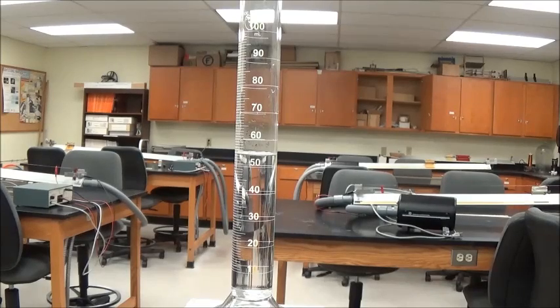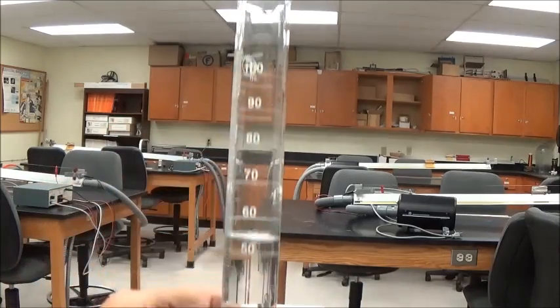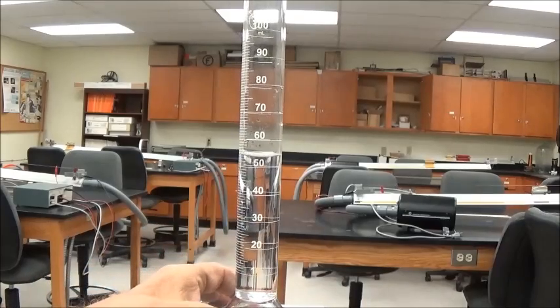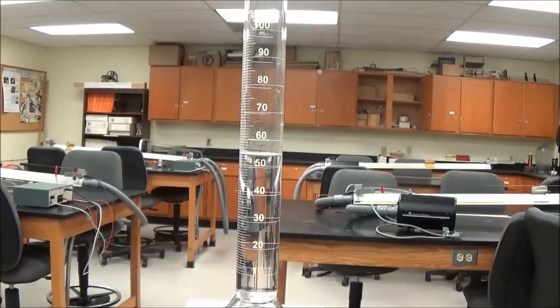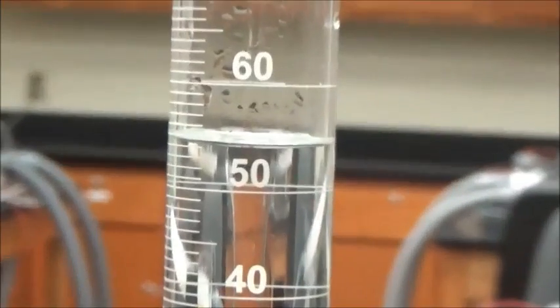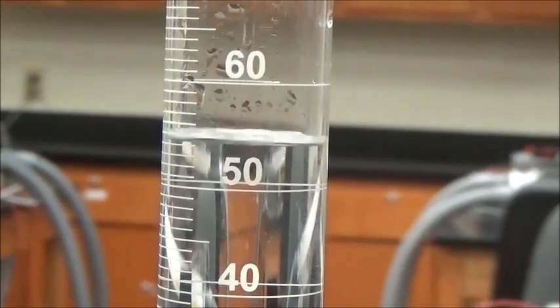In front of us we have a graduated cylinder. That's nothing but a glass cylinder with markings for cubic centimeters on it. I have those facing us. I'm going to zoom in on the cylinder, and you can see that the level of the water is at 55 cubic centimeters.